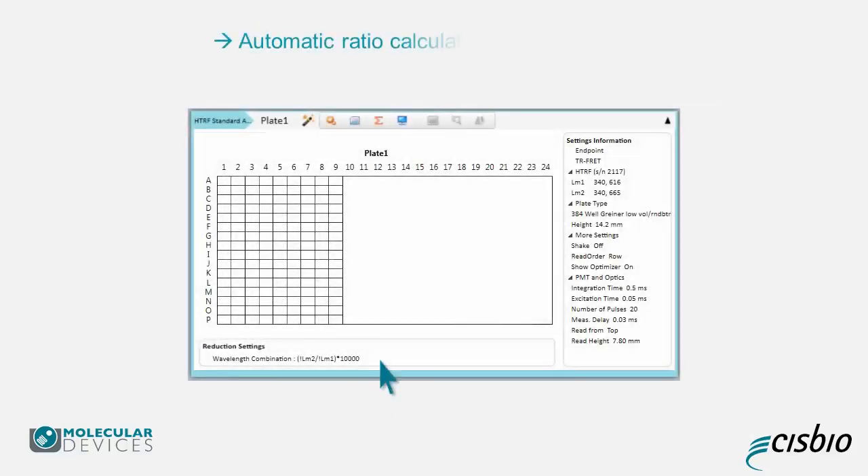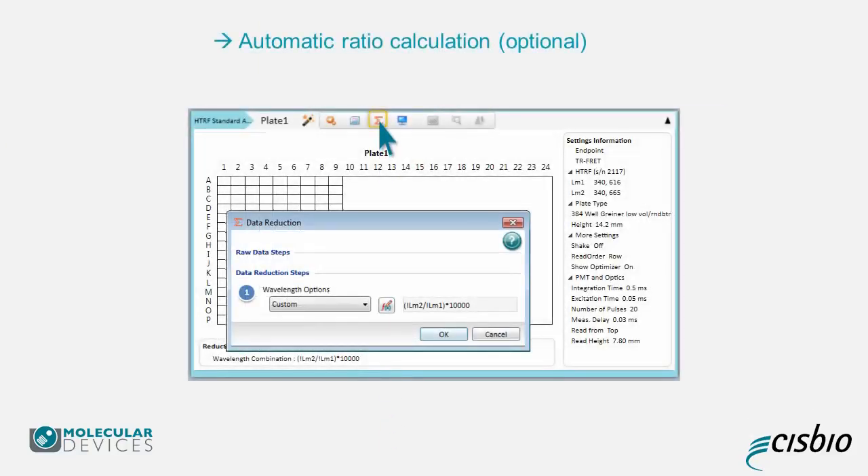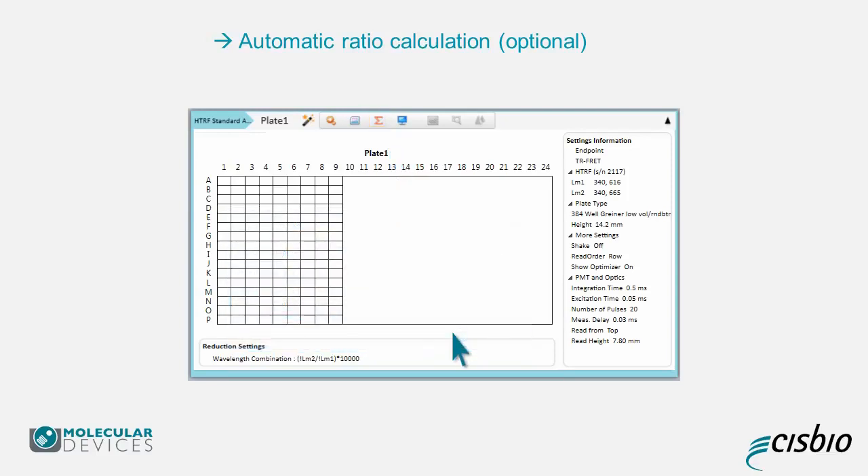Next, select the Data Reduction icon at the top of the Plate Editor to assign a formula for data calculation — for example, HTRF Ratio. Depending on the protocol you choose, the formula may already be included. If not, you can type it in, or you can also do the calculation later during your analysis.